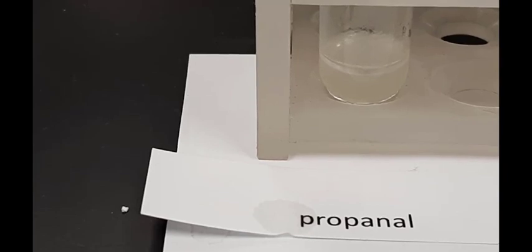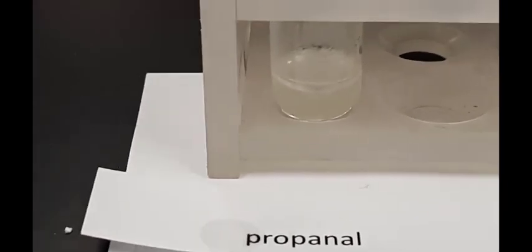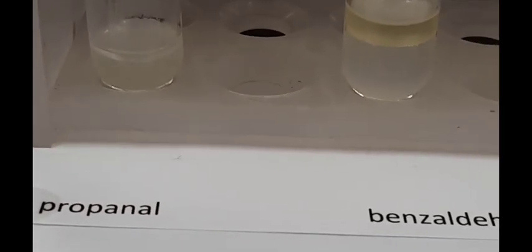Here we see propanal at the end of the iodoform test. No yellow precipitate. Benzaldehyde. No yellow precipitate. I'm going to shake that a bit. Acetone does seem to have a yellow precipitate at the bottom.